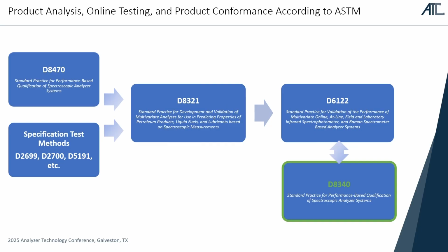It is developed for petrochemical products, but using what is written in those ASTM methods helps you in any other industry field, because it's proven in those methods what you need to do to make it a success. So D8470 is all about what the spectrograph, the spectrometer requires, the calibration of the analyzer, the standards to ensure that the instrument is always performing according to specifications.